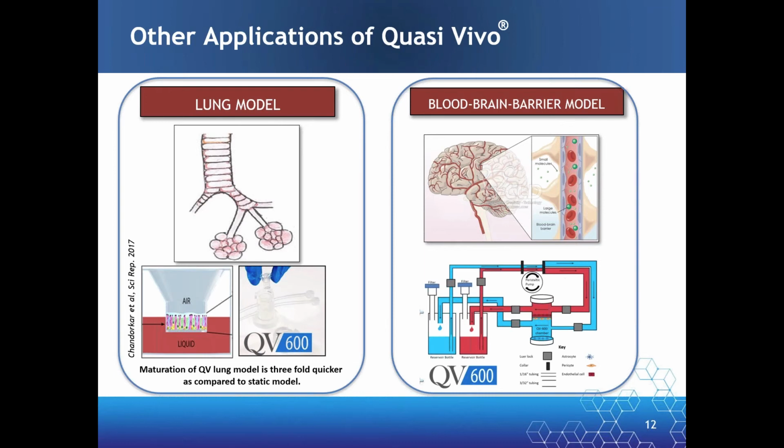So the question then is, given the flow of the media past the bottom of the basal side of the transwell, what's going to happen? Well, the flow, strangely, will actually stimulate the cells in that epithelial barrier, and the barrier function improves and viability in such a thing. So that's what we're hoping to see. You can also put the virus into the media, the flowing liquid, and see if the cells in the transwell will be affected. So those are the sort of experiments that people are going to run.